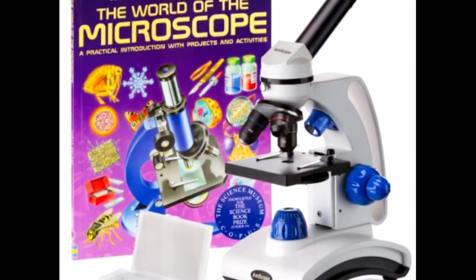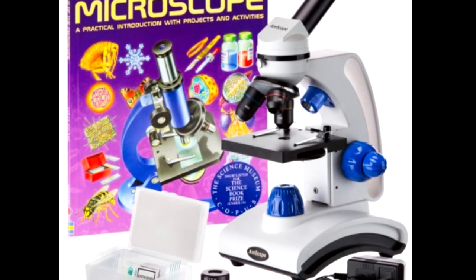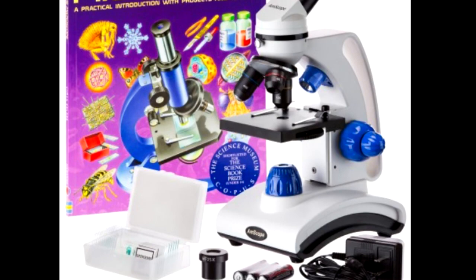So that's it. If you're looking for a good starter microscope for elementary and even middle school-aged kids, the Amscope M162C is a very good choice.